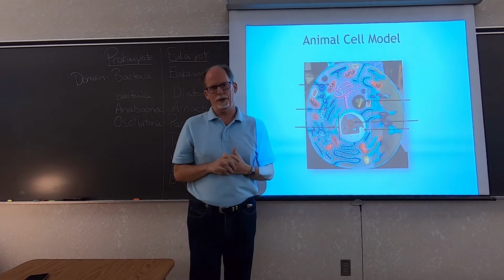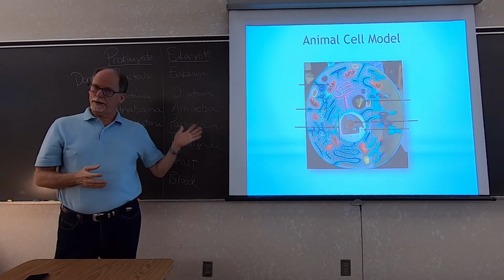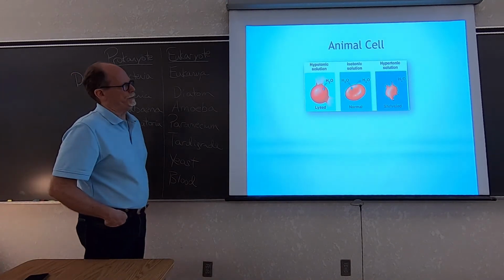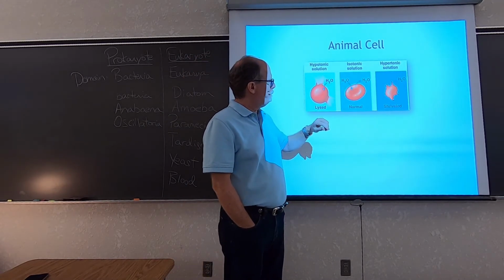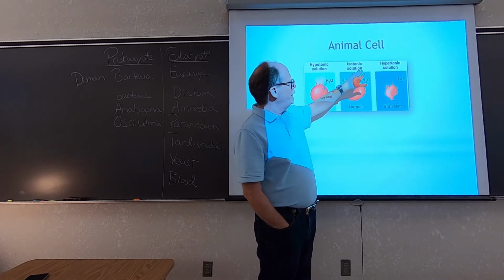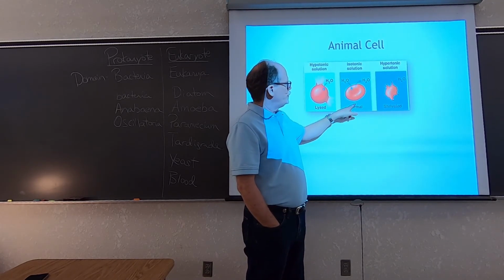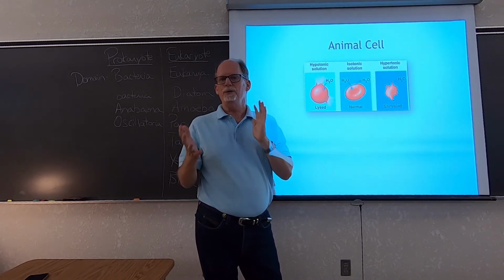Okay, and those are the parts of the animal cell model, which when you take the practical, I might expect you to know the different parts or the different organelles found in the animal and plant cell. So another thing to mention is that when you describe a solution that has cells in it, so these are supposed to be red blood cells, the solution and the solution that's in the cell itself are two different solutions.